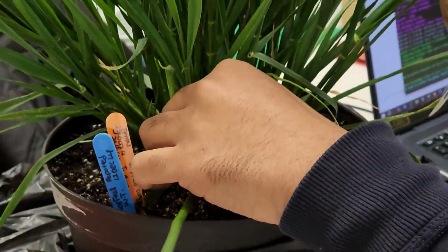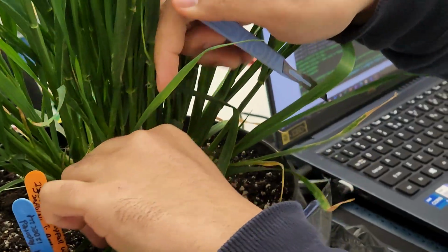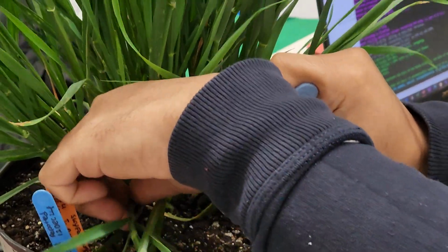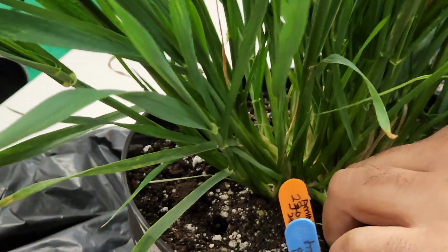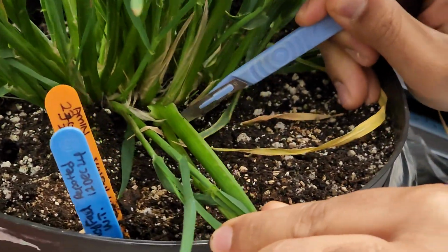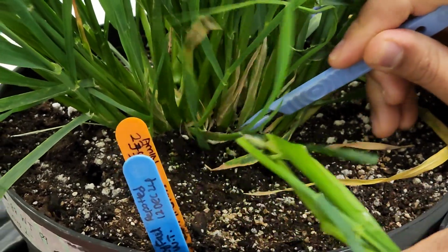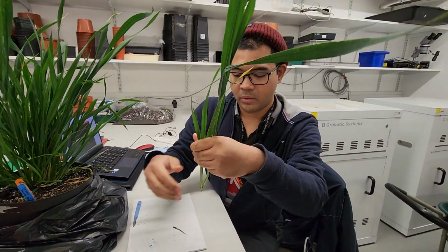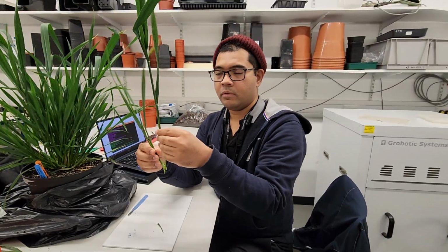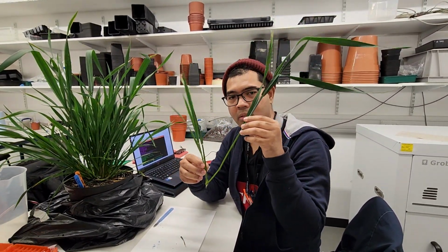You know what? I'll just get a bit more all the way down there, because if we miss it, it's not the meristem, but just the regular culm of it. So I'll do the cutting there. You see, super blunt, but that's what you need. Right. So this is the whole unit of culm, and the one attached to it is the tiller.